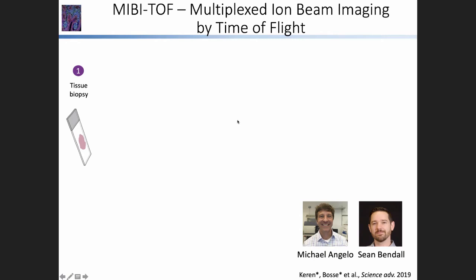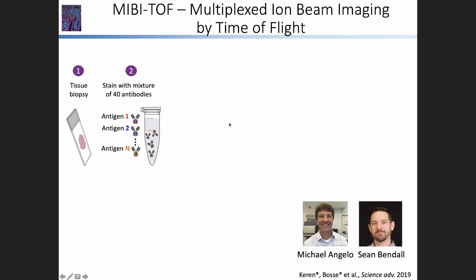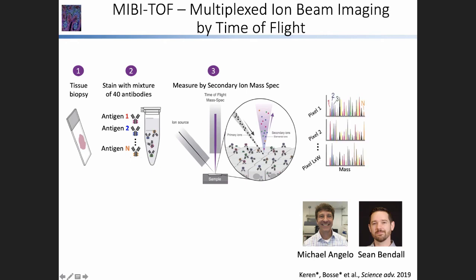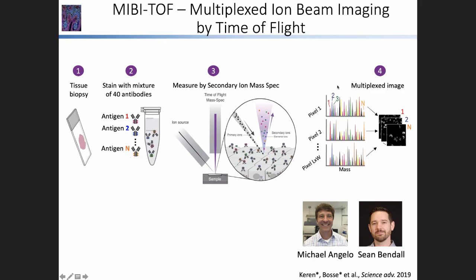The way MIBITOF works is as follows. We start with a tissue biopsy, just as you would start with any clinical specimen, and we then stain it with a mixture of 40 different antibodies. Each one of these antibodies is labeled by a different metal tag, very similar to what one does in CyTOF. Once these antibodies bind their targets in the tissue, we can visualize them using secondary ionization mass spec, raster the tissue pixel by pixel, thereby releasing the metals bound to the antibodies. For each pixel, we get a mass spectrum depicting the protein expression in that region, from which we can then reconstruct the multiplexed image.